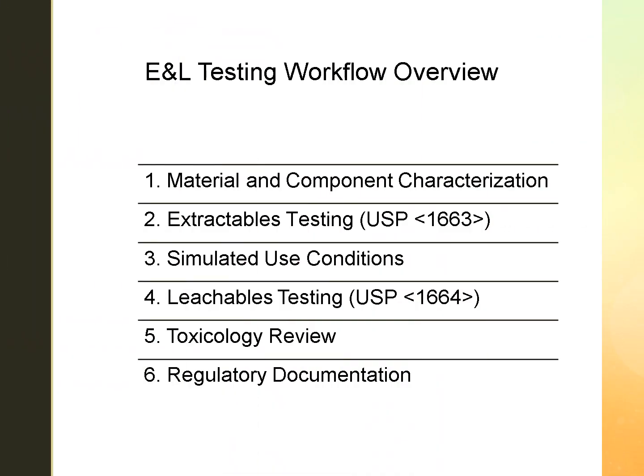To make all this work, we follow a structured, step-by-step workflow based on USP 1663 and 1664. It begins with material characterization, moves through extractables testing, simulated use, leachables analysis, and ends with toxicology review and regulatory documentation. Each step builds on the one before it, ensuring nothing is missed, from chemical identification all the way to risk assessment and report submission.